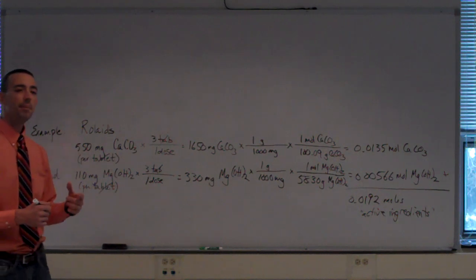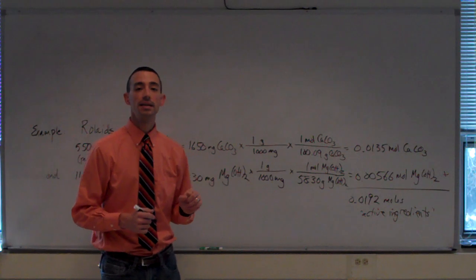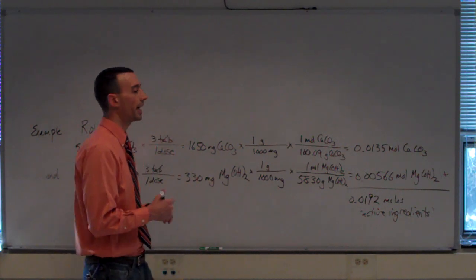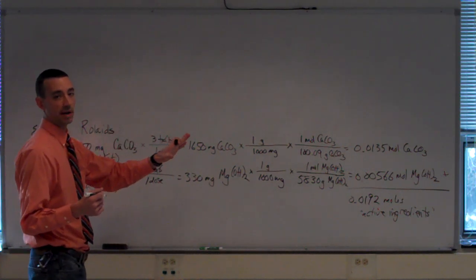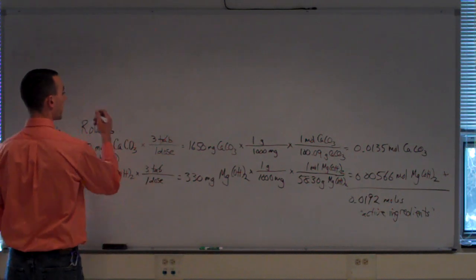Okay? Now, how many moles of acid can be eliminated by these active ingredients depends on the reaction that each respective active ingredient has with hydrochloric acid.